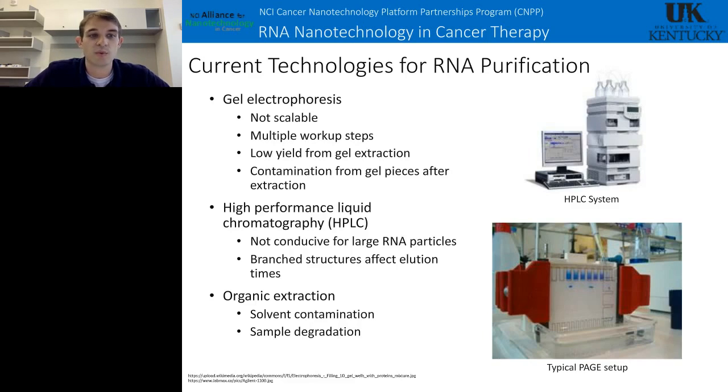A lot of the particles we make, as you will see later, are branched. The RNA itself is pretty flexible, so it can adopt multiple conformations. This will affect its elution time off of the column, and you'll end up with a low yield because you miss your fraction collection, or you will get an impure product, which is a big concern when we're trying to get reproducible results, especially in vivo.